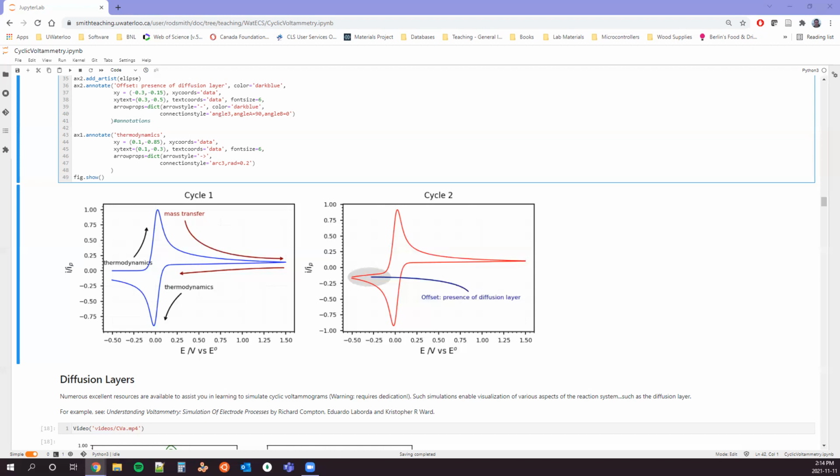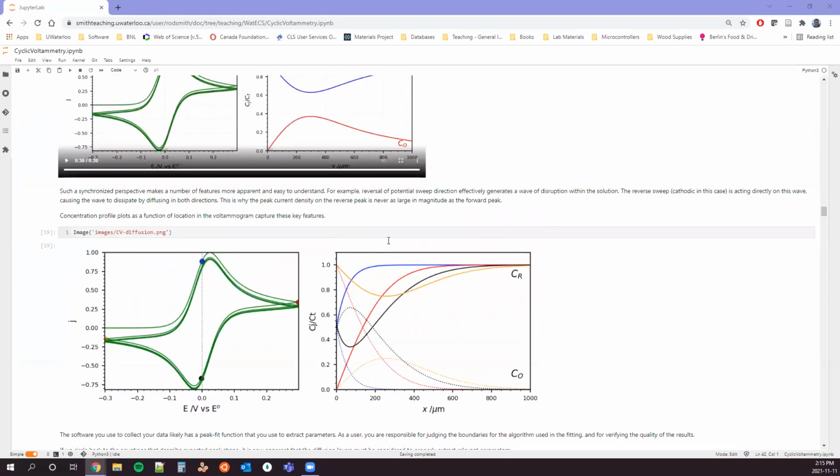These examples are all for parallel diffusion. If you have a fully conductive surface that's just very rough, it depends on the current flow. If you look at an ultramicroelectrode, you never really run into mass transfer issues. But if you make an array of ultramicroelectrodes on a surface, what you start seeing is the diffusion layer coming back in. We've drawn here these diffusion layers going out into two-dimensional space. In Bard's textbook, he's got a nice little example of what happens with time.